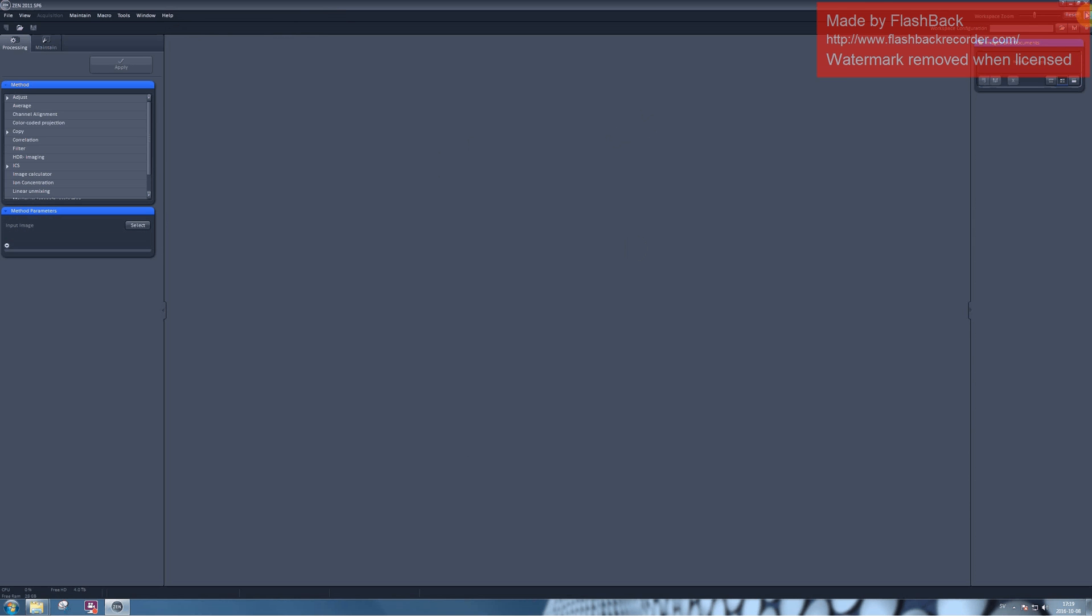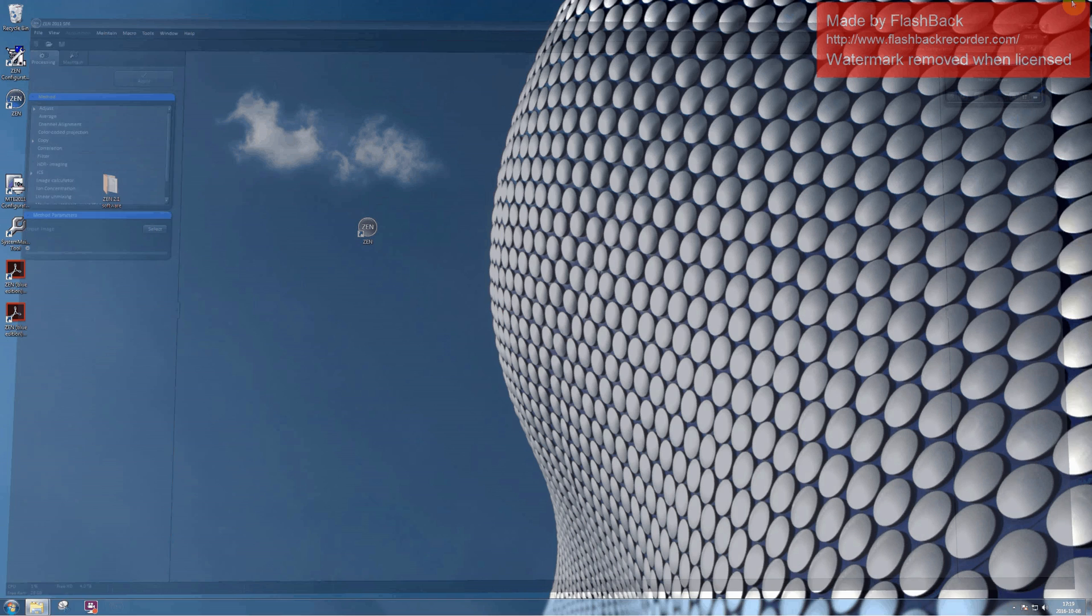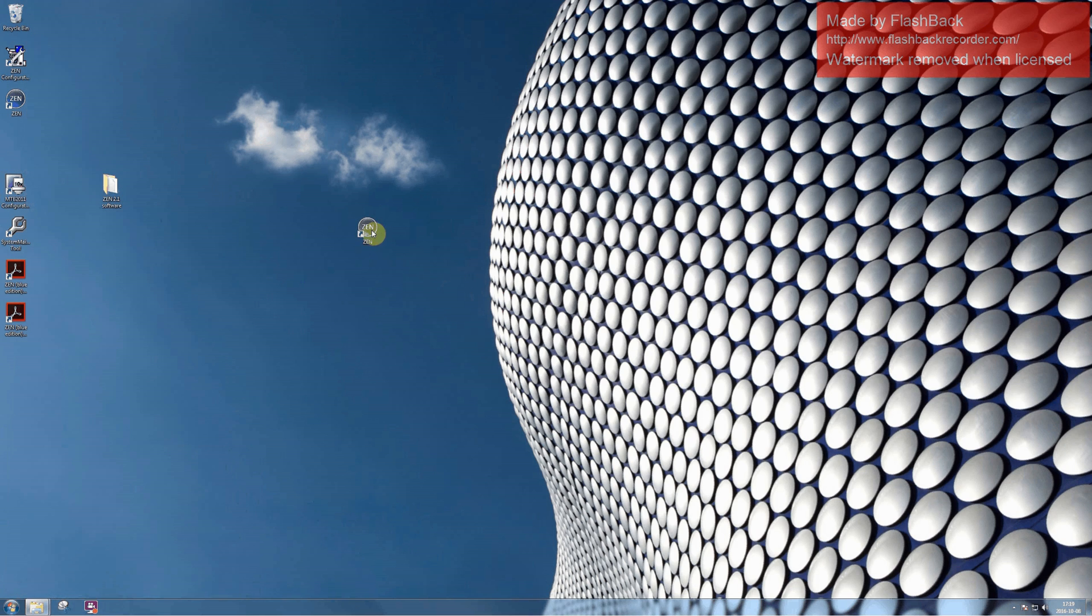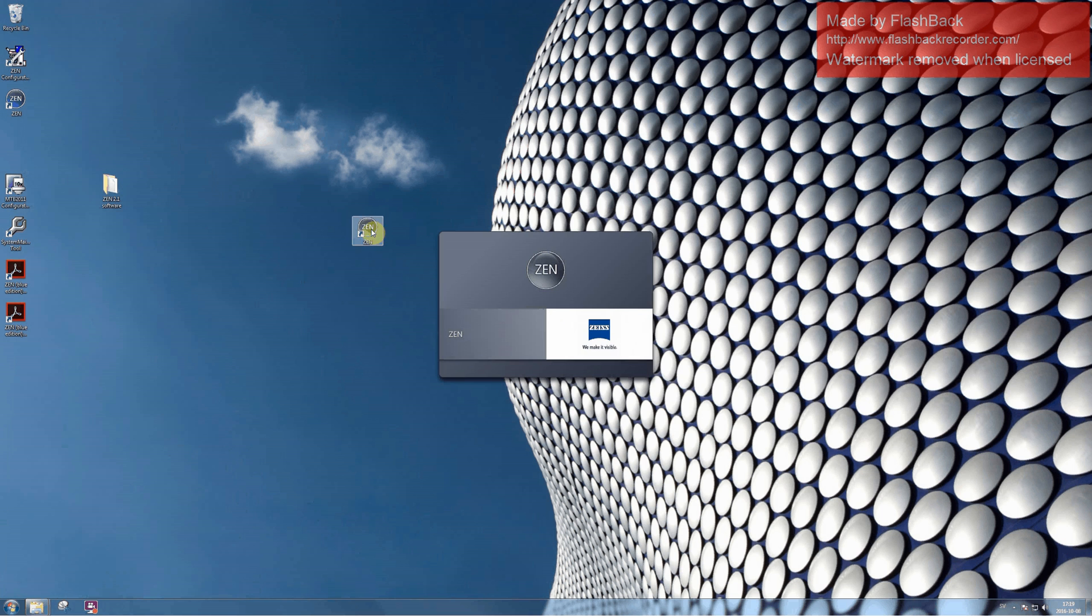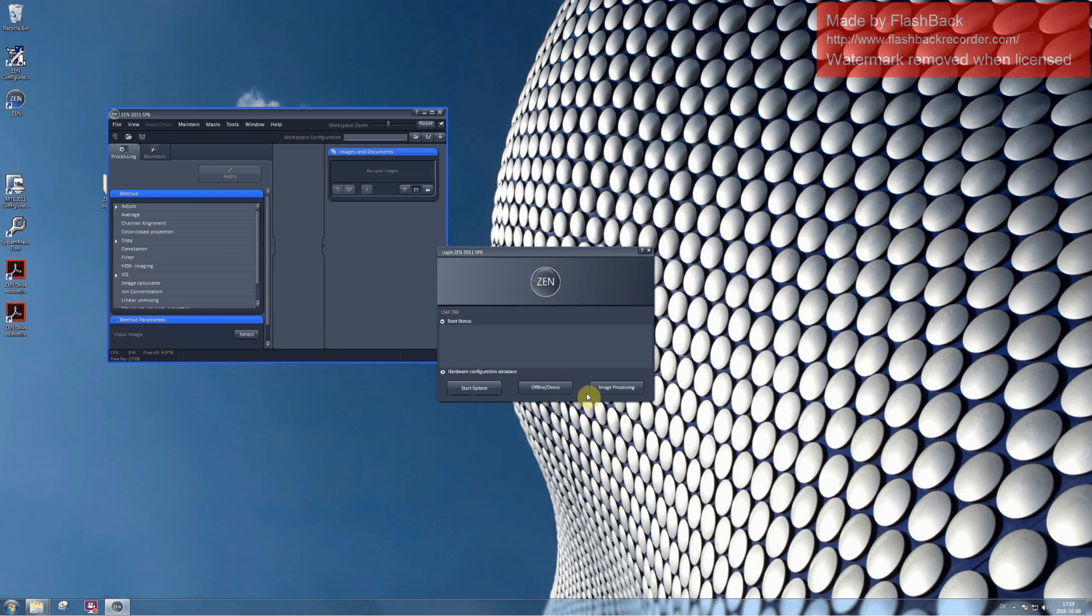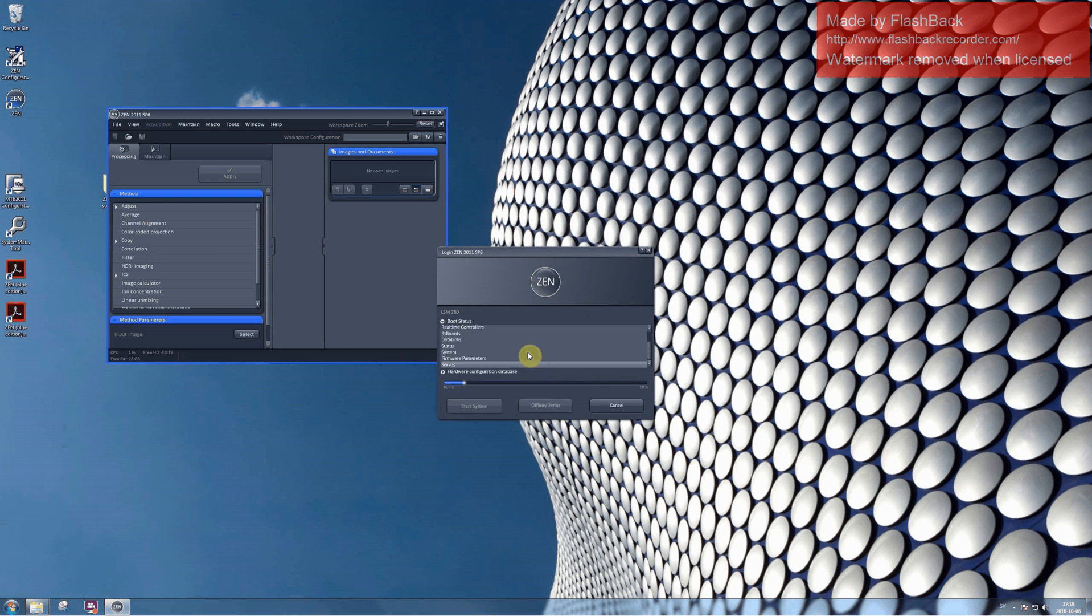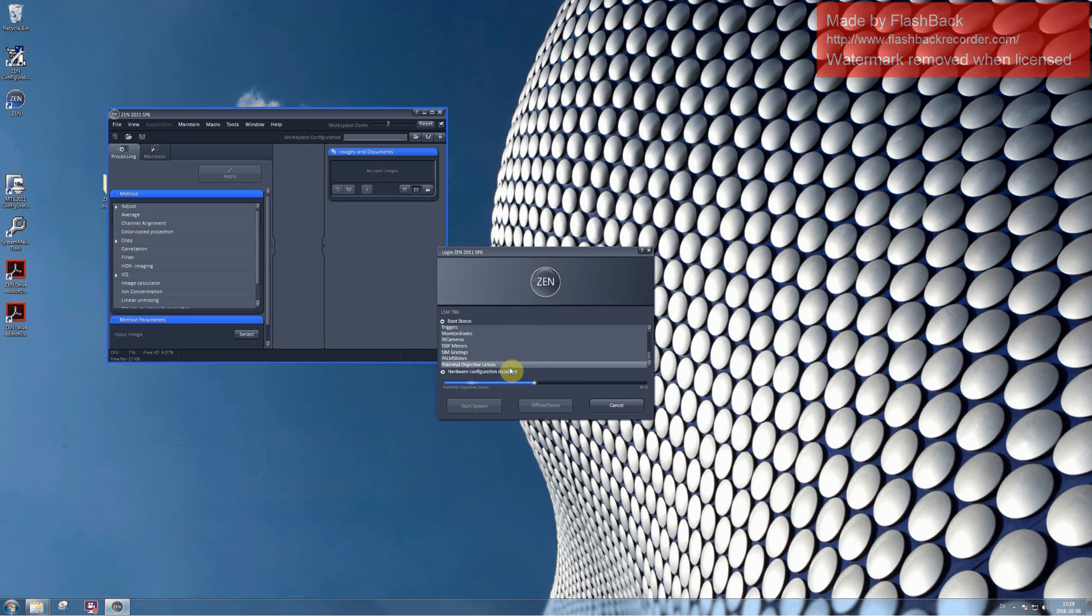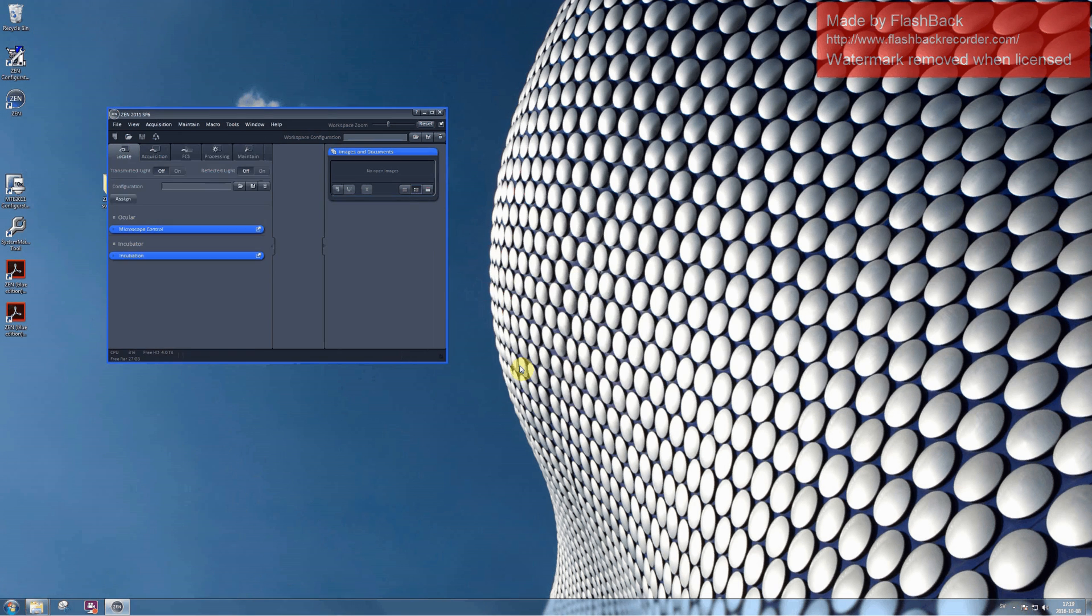If you would like to run a simulator, please open Zen software in a slightly different way. Go to Boot Status menu and click on Offline Demo. And as you can see now the software is loading configuration which corresponds to the configuration of our LSM 780.